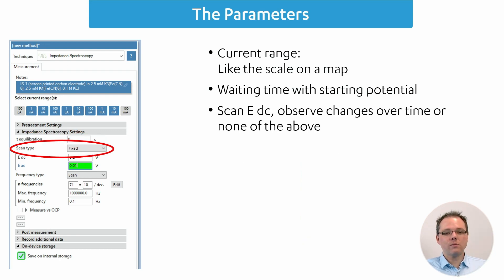The next option allows you to choose the type of scan you want to perform. Most of the time—so this is not the frequency scan, we'll get to that later—it allows you to scan the EDC, or you can scan the time, or none of the above. This is what I've chosen here, this is fixed.